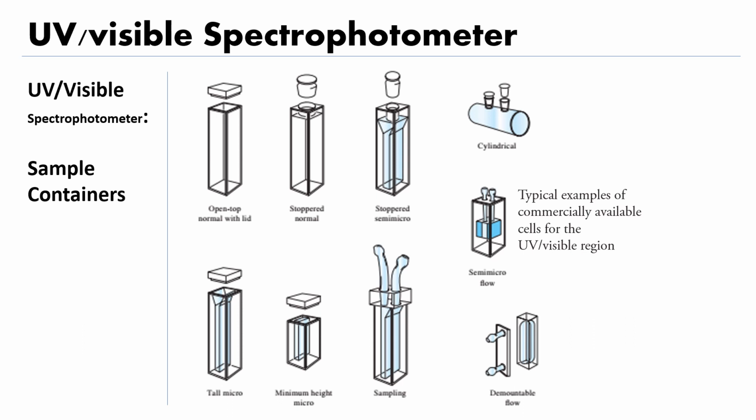And you know the path length for this cuvette is 1 centimeter. That path length means the breadth or the length of this cuvette.